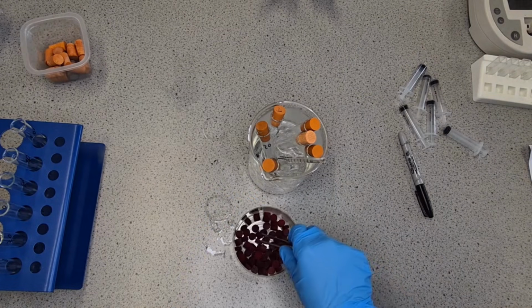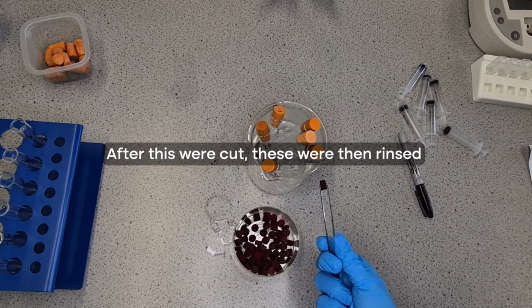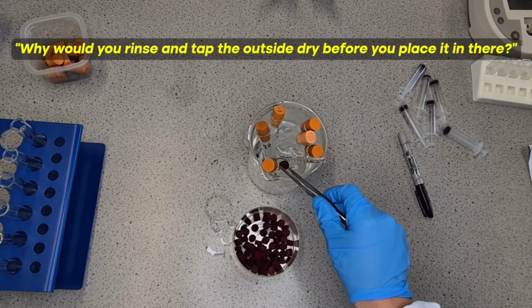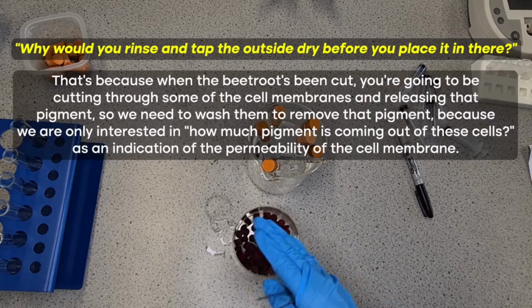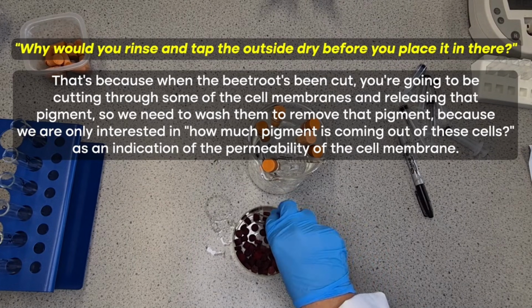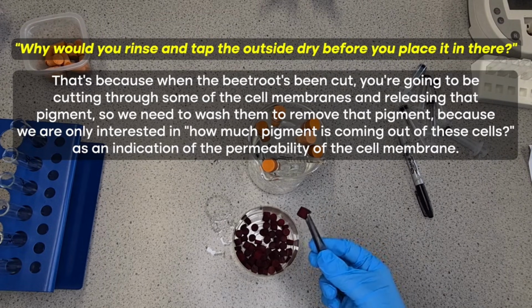Now, after these were cut, these were then rinsed, and that's another really common exam question. Why would you rinse and tap the outside dry before you place it in there? And that's because when the beetroot is being cut, you're going to be cutting through some of the cell membranes and releasing that pigment. So we need to wash them to remove that pigment, because we are only interested in how much pigment is coming out of the cells as an indication of the permeability of the cell membrane.